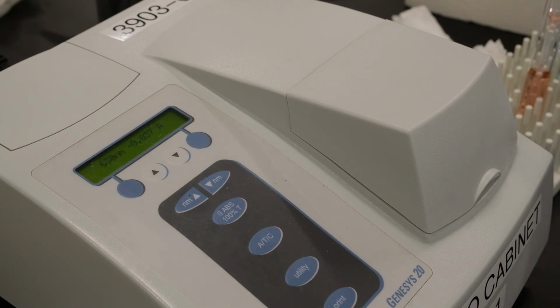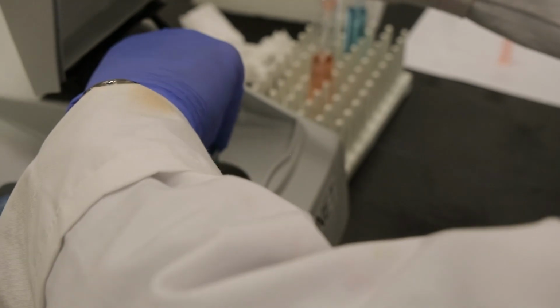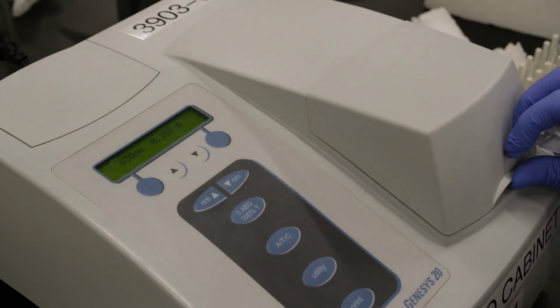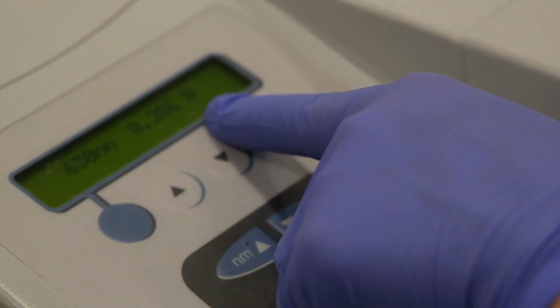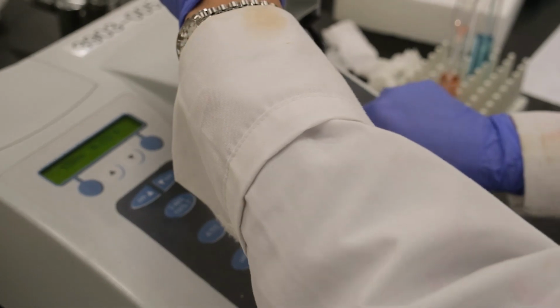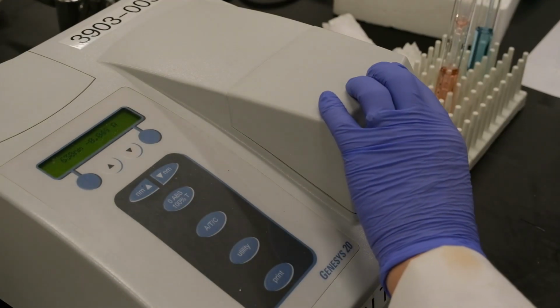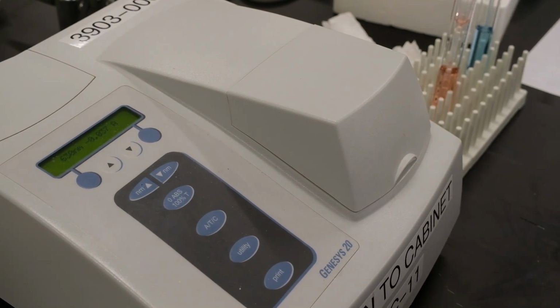And we measure the absorbance of the brilliant blue that we obtained from the grape Kool-Aid. So this is the value. From these values, using the equation that we saw during the explanation, we determine the concentration of the two solutions.